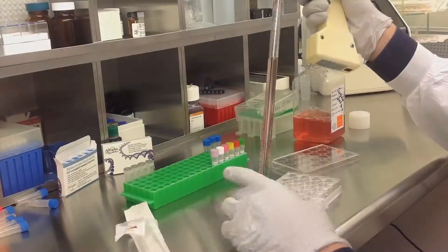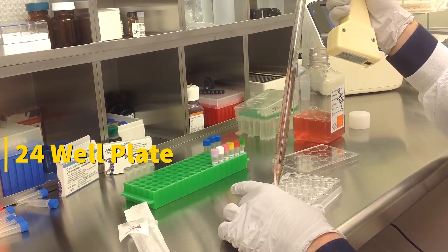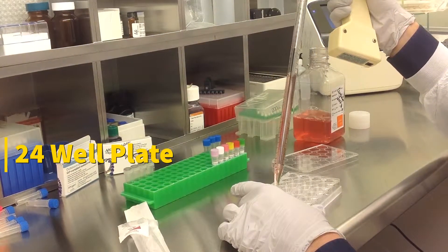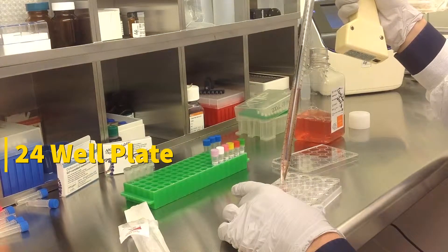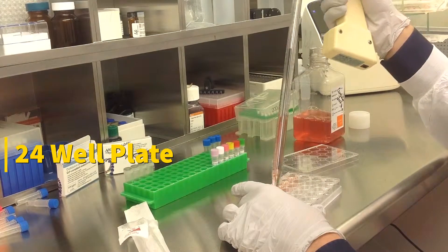Today we'll be transfecting C2C12 cells obtained from ATCC, using a transfection kit manufactured by Altigen BioSystems. In this tutorial, we use a 24-well plate. Transfections can be scaled up or down based on plate surface area as described in the corresponding transfection protocol, which can be found at altigen.com.